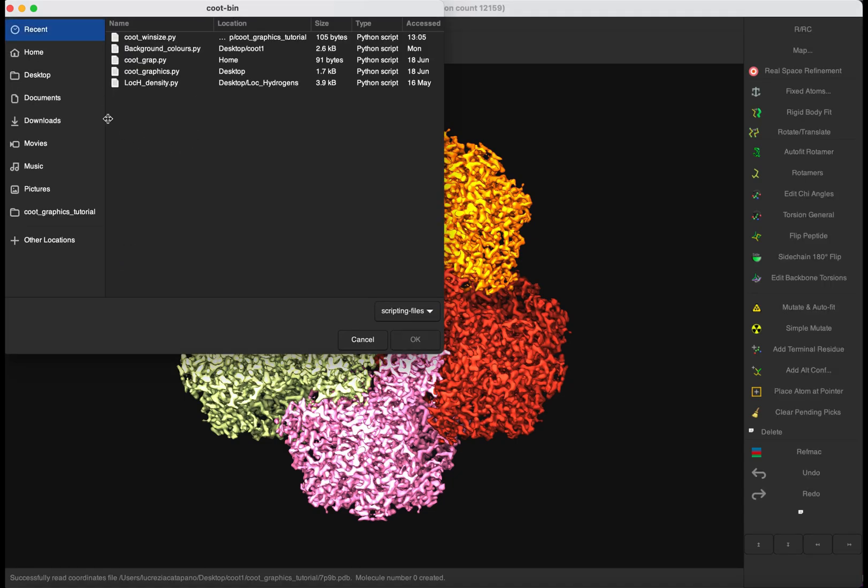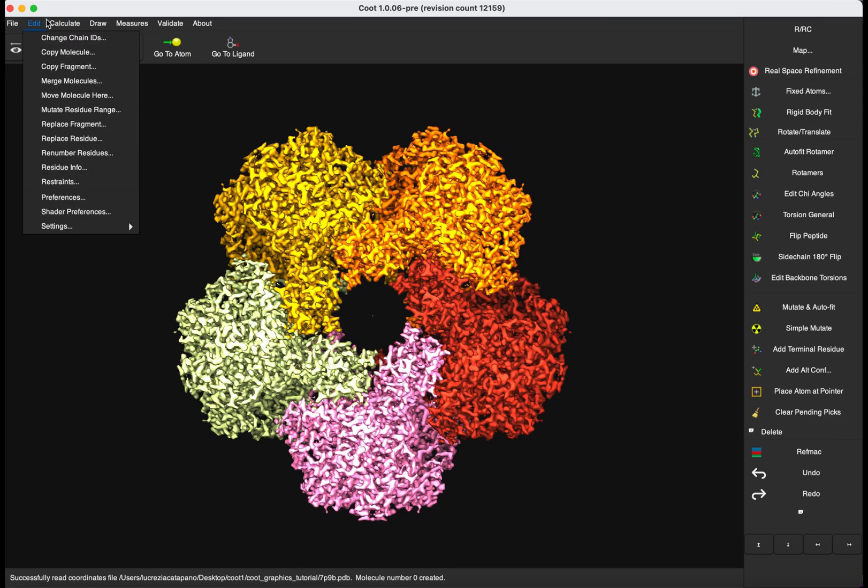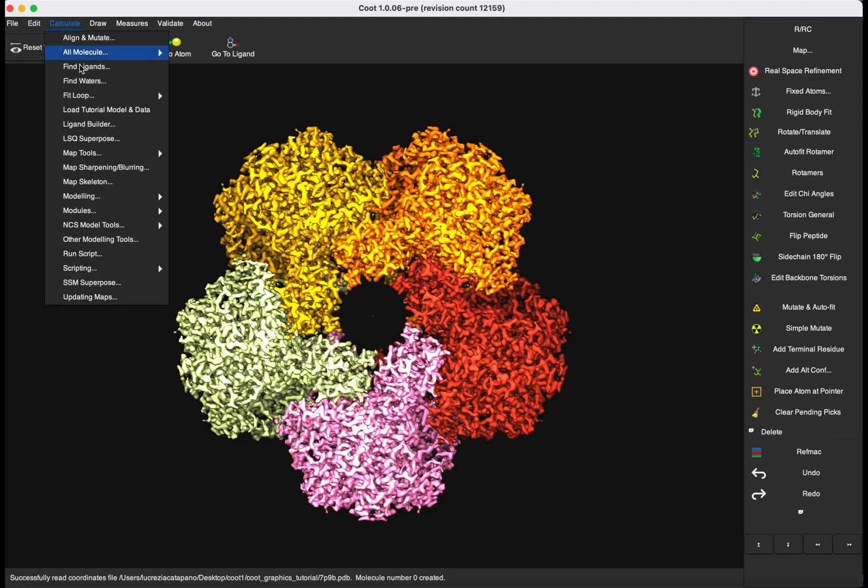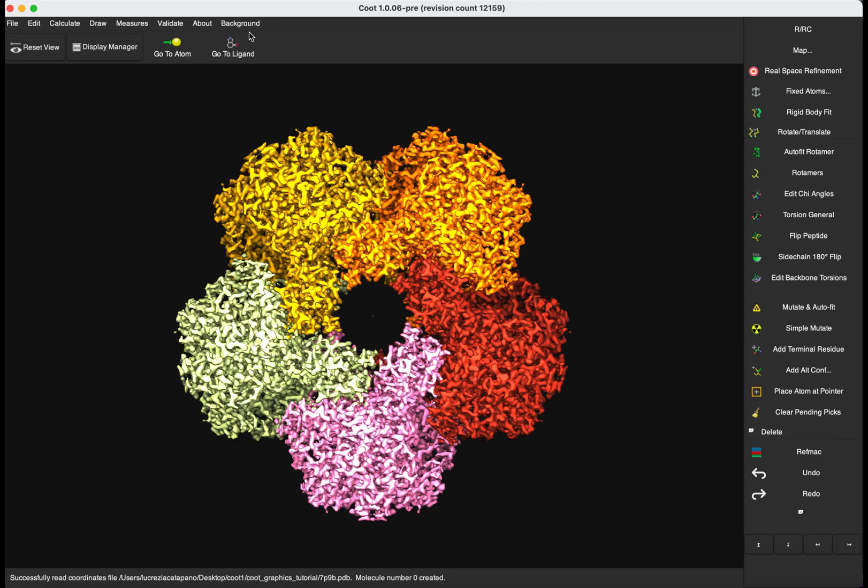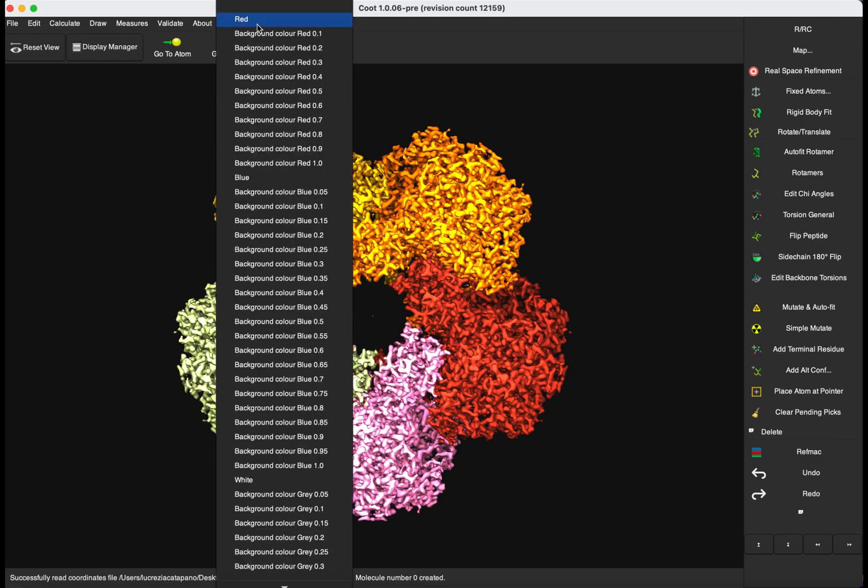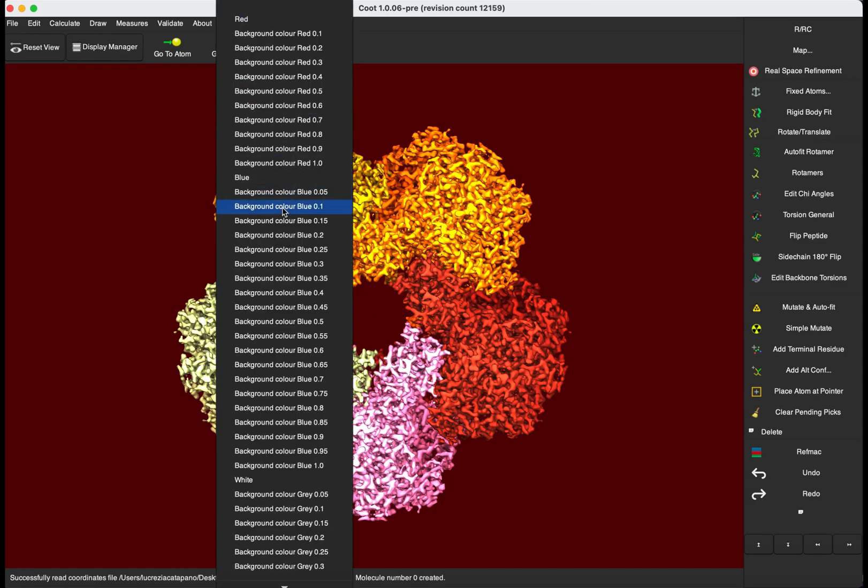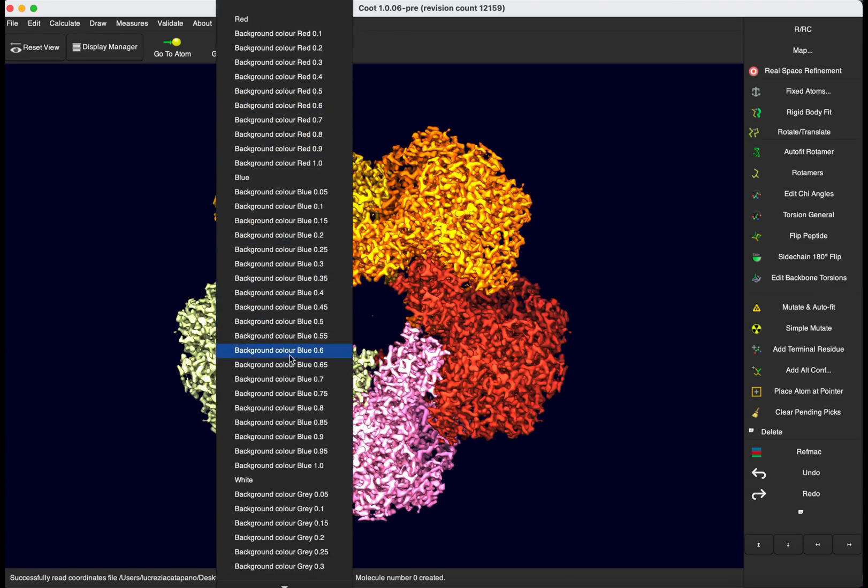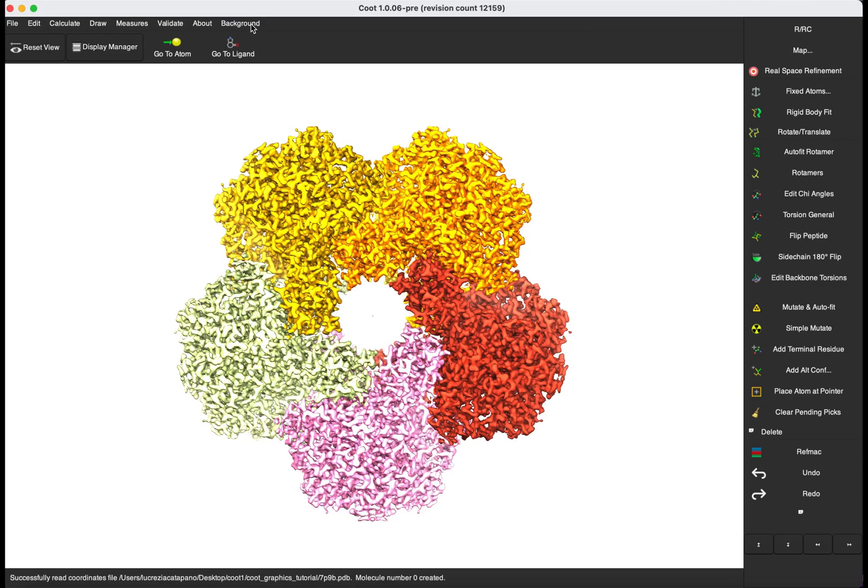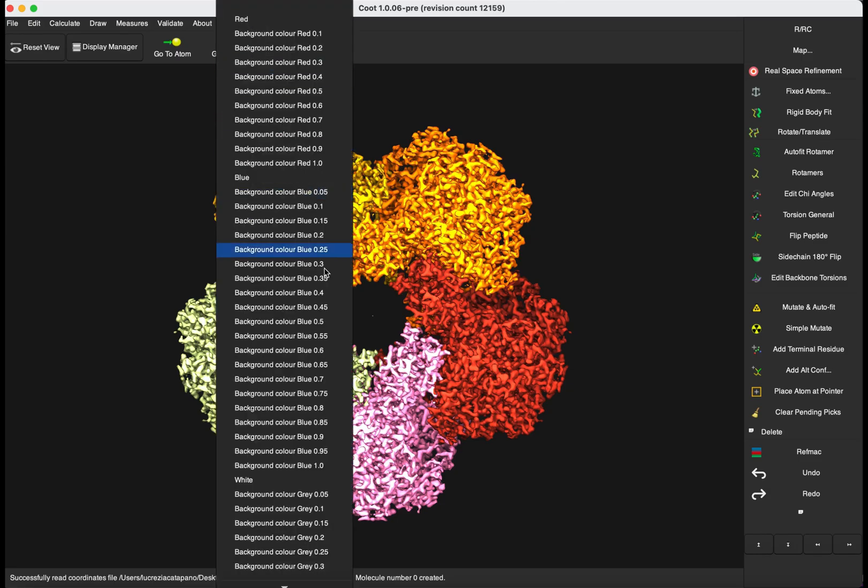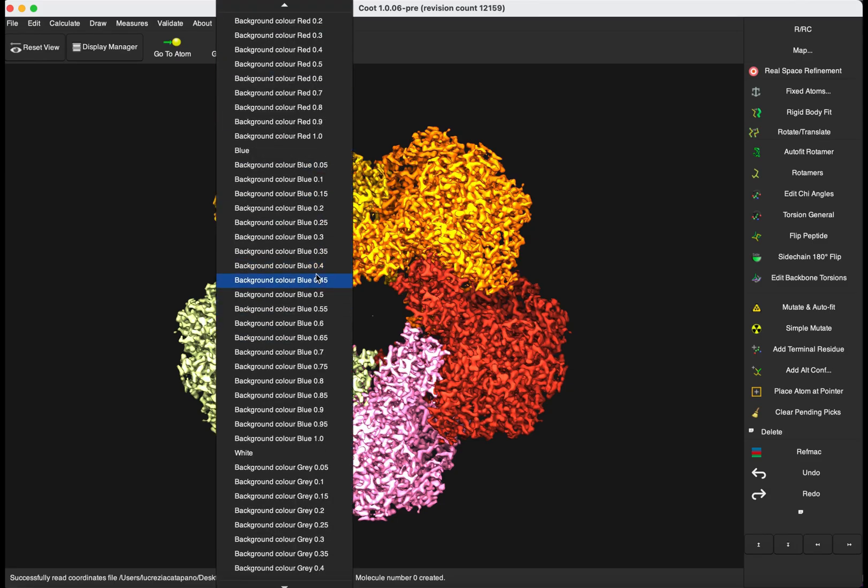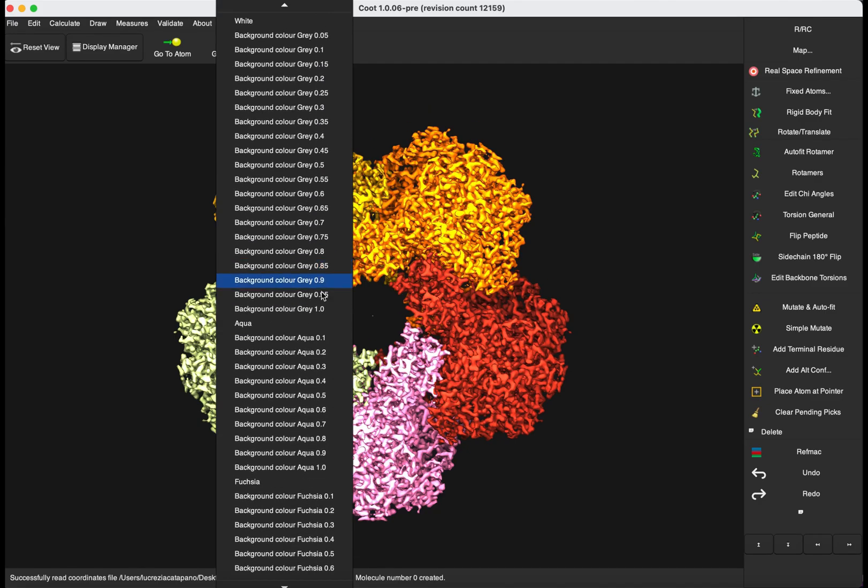We can also run the script directly from the Qt window instead of using the command line, using Calculate, Run Script, and have the same result. I also wrote a script for having different background colors to be used in Qt. Calculate, Run Script - that gives us a new menu, Background, with different colors to be used as a background - for example red, blue, white, dark gray, aqua, yellow. So you can explore different background colors.